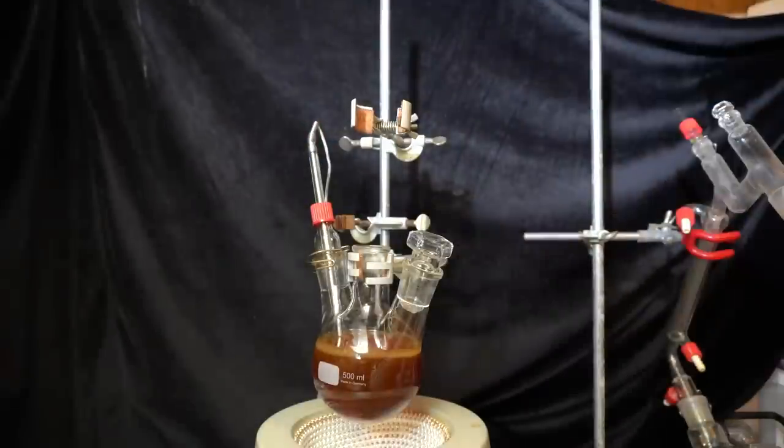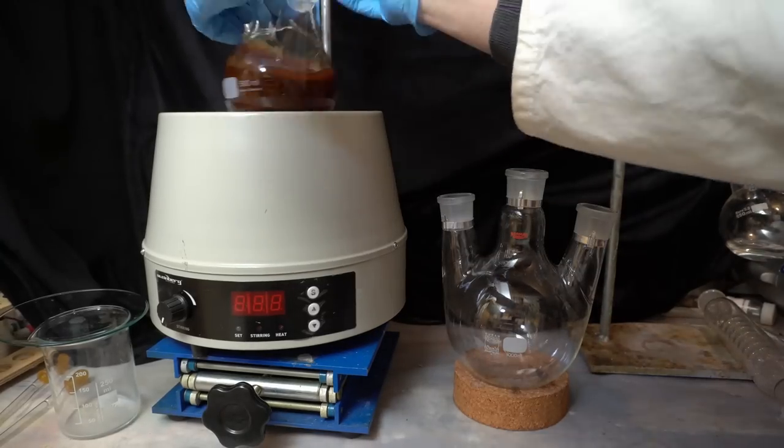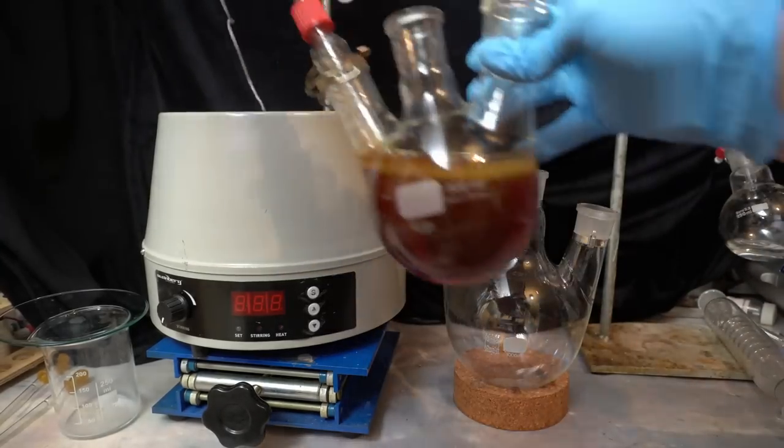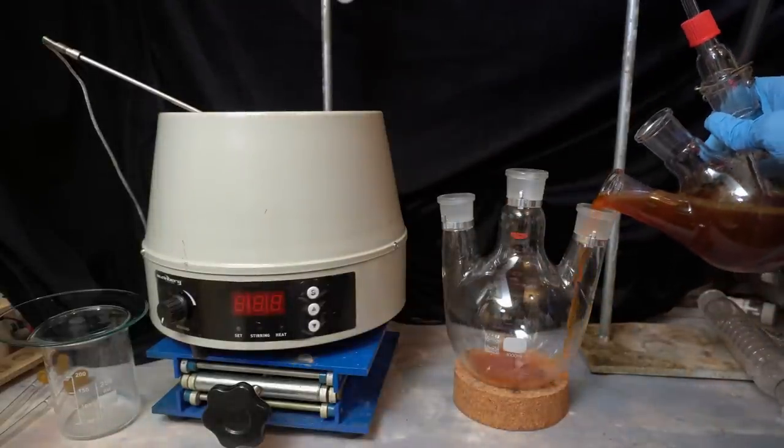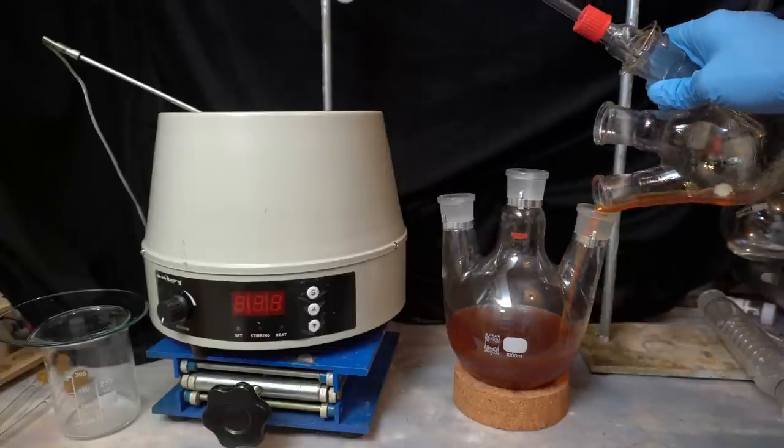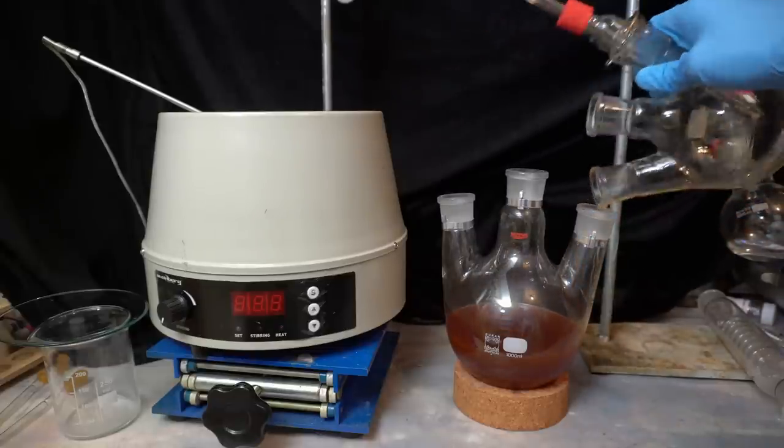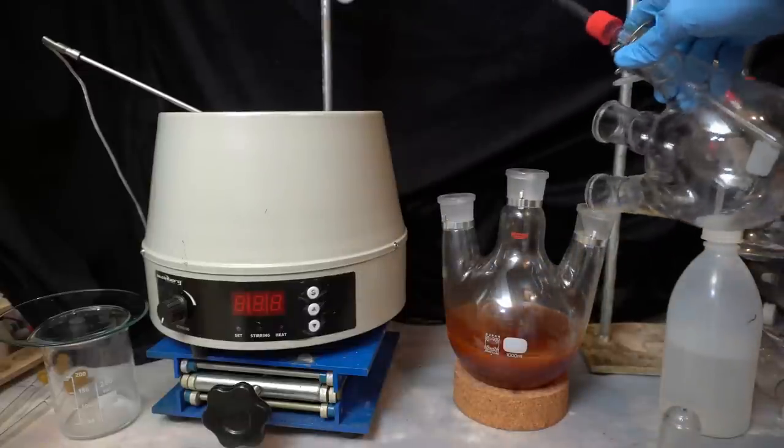However, the ethanolamine also co-distills with water. In order to prevent this I will neutralize the solution with hydrochloric acid. The ethanolamine is much more basic than the dimethylaniline so it will be converted into a salt at a pH around 7 where the dimethylaniline will still be free-based. And as a salt, ethanolamine will no longer distill over.